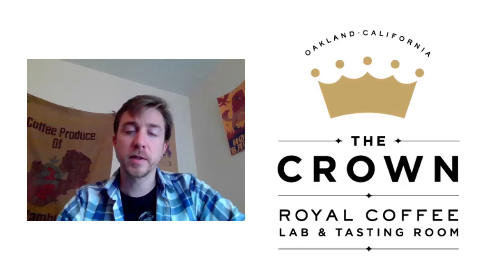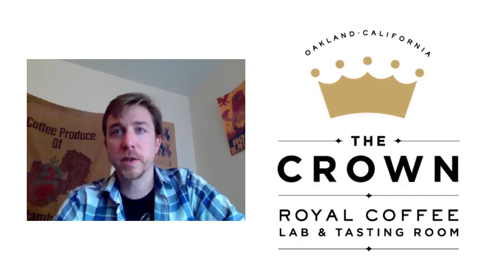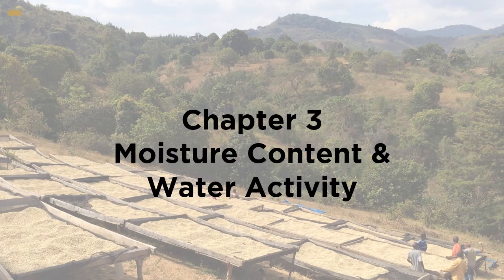Hey folks, this is Chris Kornman, Lab and Education Manager at the Crown, and welcome to the physical analysis of green coffee. This chapter will cover moisture content and water activity. Much like the human body, a freshly harvested coffee cherry is mostly water. A great deal of time and energy are expended to dry the seed of that cherry.